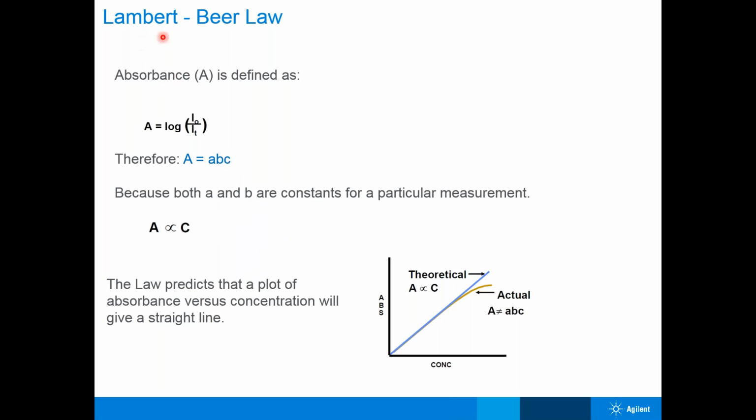So if we see the Lambert-Beer law practically, ideally you will get a curve like this, absorbance versus concentration, always a straight line. But actually, after a certain level, it becomes saturated and your curve starts moving like this. If you get a curve like this, it means you have to select another wavelength. This is the reason why, when you are working on the AAS, you will get a number of wavelengths, spectral lines, and you have to select one when you are quantifying using the AAS.